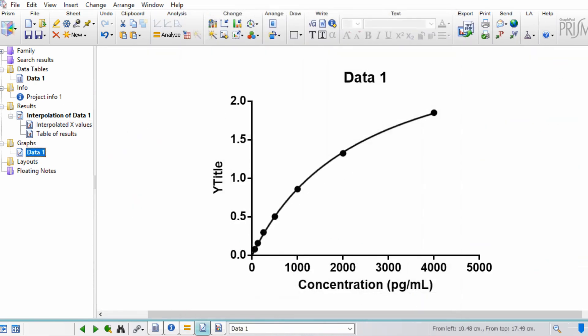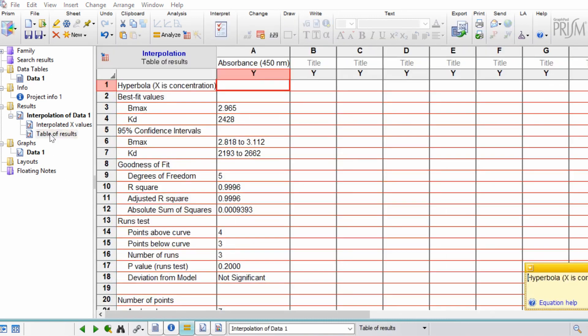You'll also find another table of results sheet underneath your interpolated values, which will give you more information about your standard curve, for example your R squared value.